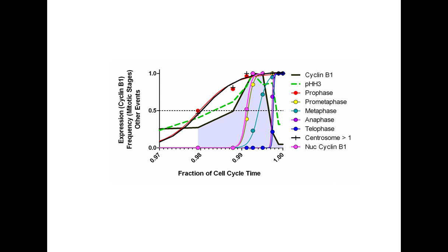The expression of cyclin B1 through this period is maximal and stable, but the density sharply rises at the end of prophase. Metaphase is more variable, but by the time most of the cells have entered, cyclin B1 density remains high. By the time anaphase begins, cyclin B1 density is falling. Thus, we can quantitatively correlate expression, movement of molecules, and morphological changes.